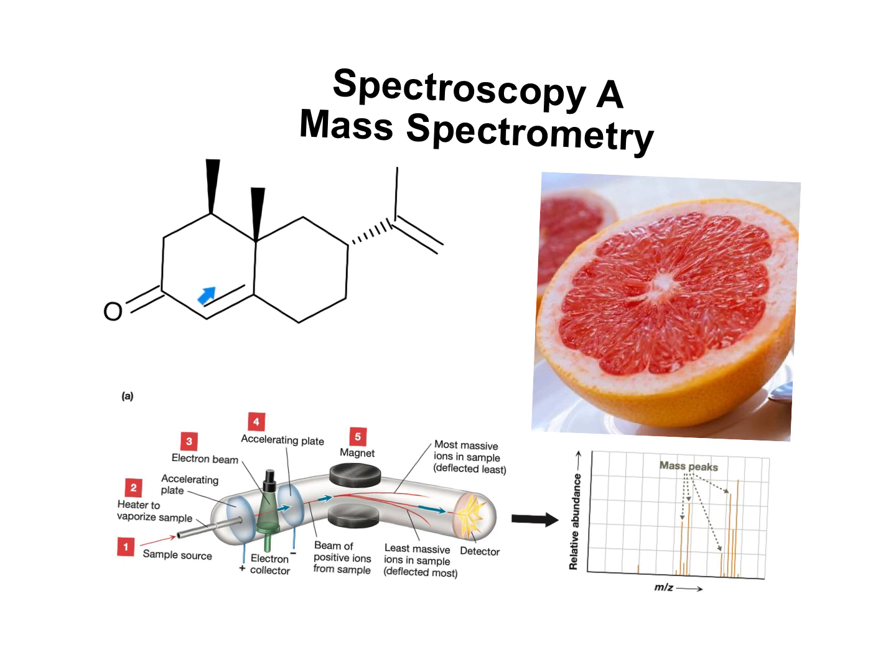I want you to look at the molecule here. This is nootkatone, and I'll spell it. It's a really fragrant lipid that's a key component in the aroma of grapefruit.